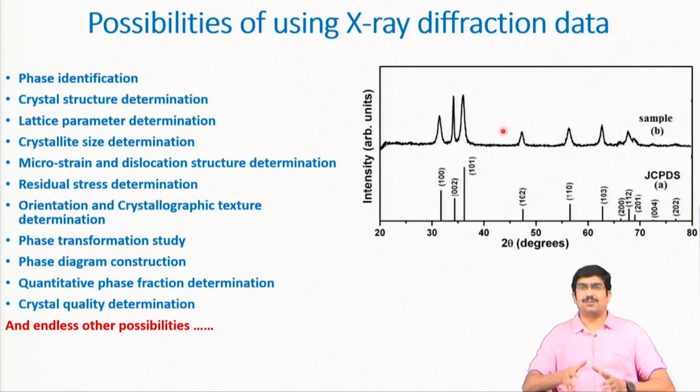X-ray diffraction is possibly one method which is very useful and very powerful, developed possibly long back, almost 120 years ago or even more, but still people are using it, and there are many other applications you can think of. I request all of you to go through the reference books to know more about what you can do with this X-ray diffraction data, and of course, we will be happy to help if you have specific queries about where you can use X-ray diffraction.